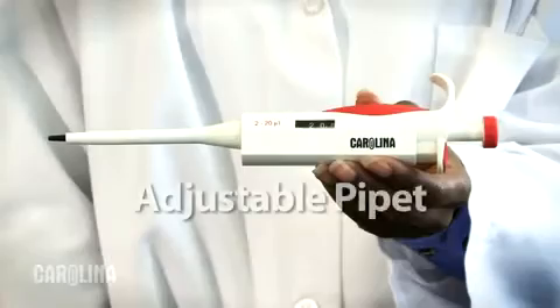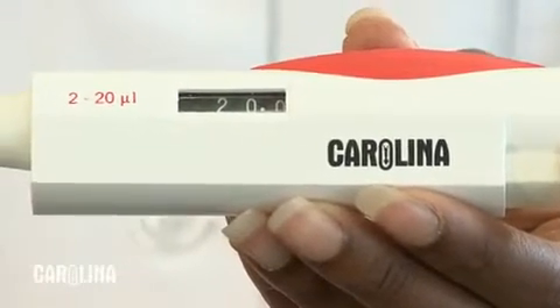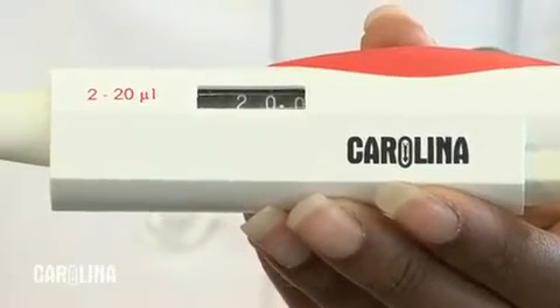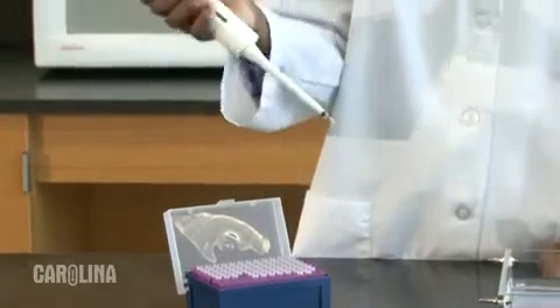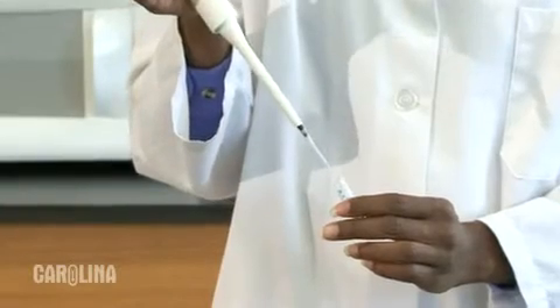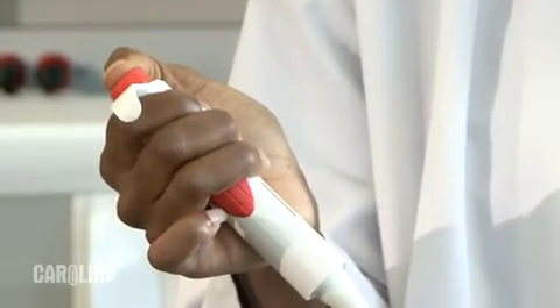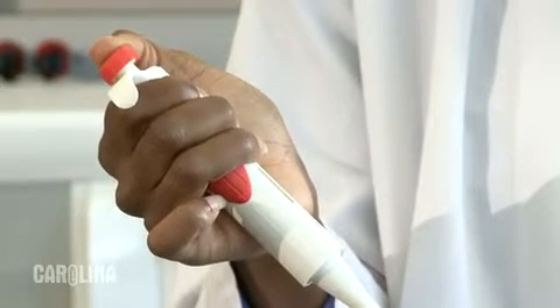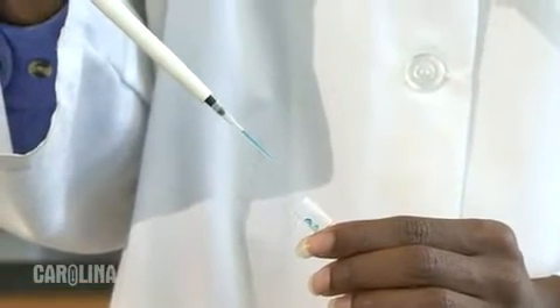If you are using an adjustable pipette, adjust the volume on the pipette to the needed volume — in this case, 20 microliters. Firmly place a tip on the pipette. Push the button on the top of the pipette down to the first stop. Place the tip into the sample while continuing to hold the button down. Draw the sample into the tip by slowly releasing the button. Don't allow the button to release too quickly.